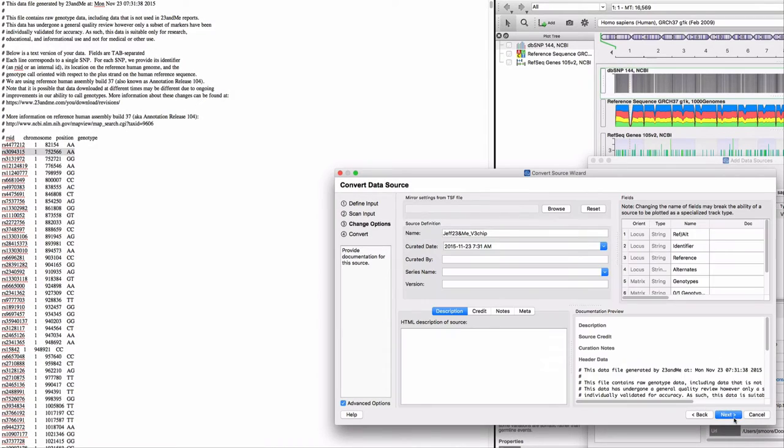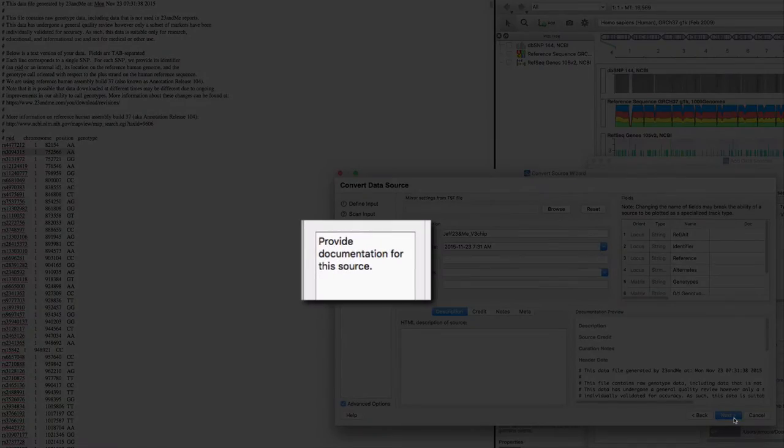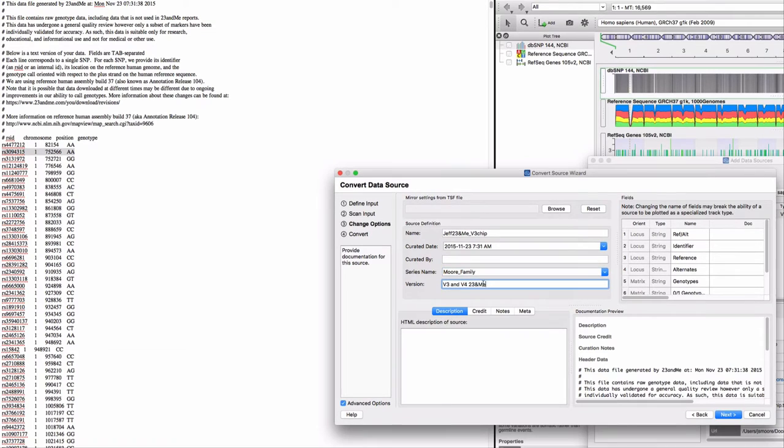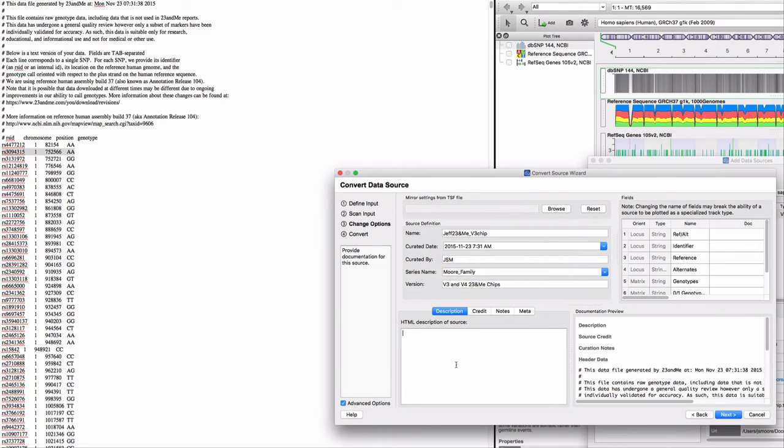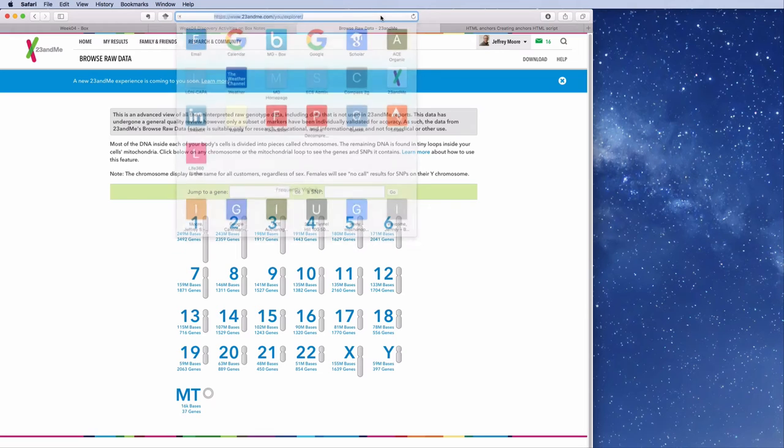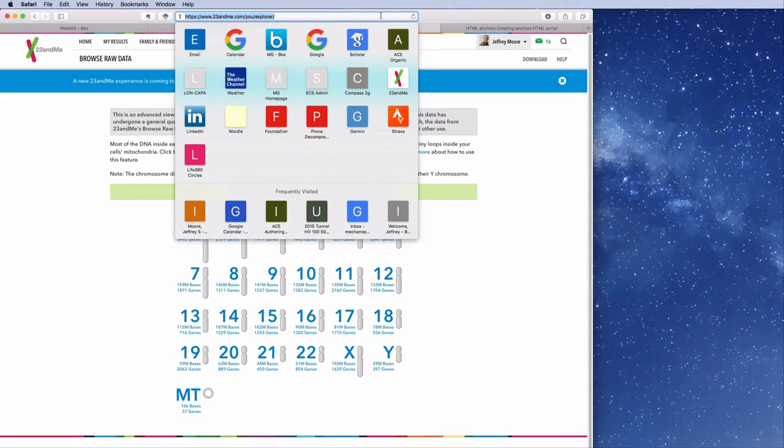Now I'll add some documentation so I remember the details about the origin of this data. Take advantage of HTML tags if you want to link out to resources. For example, you may want to link out to the 23andMe data source.